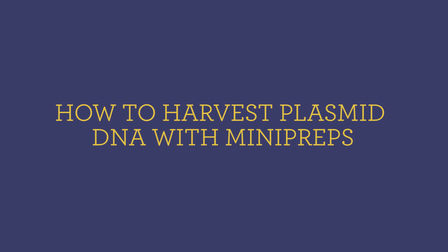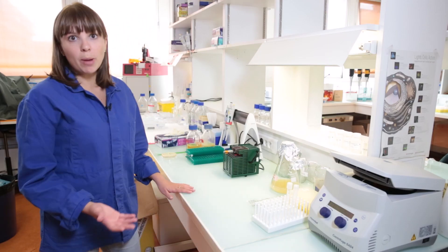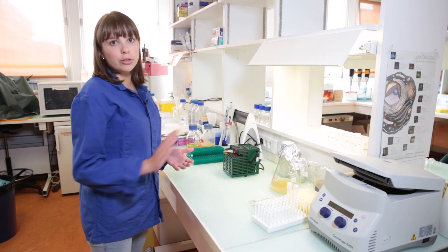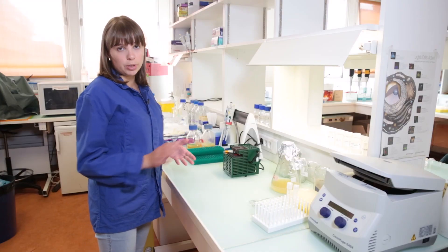Hi, today we'll be extracting plasmid DNA from bacteria. It's a protocol that's usually called a mini prep. It's called mini prep because we will be extracting DNA from a small volume of bacterial culture. You can also do midi preps and maxi preps from bigger volumes, but we won't discuss it today.